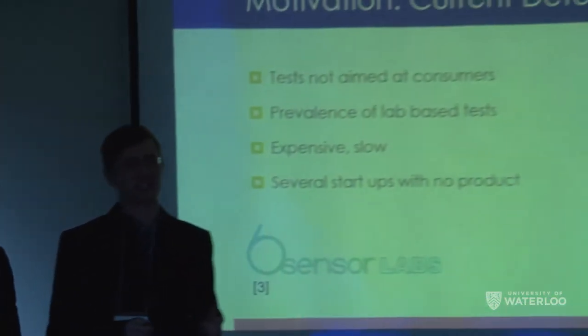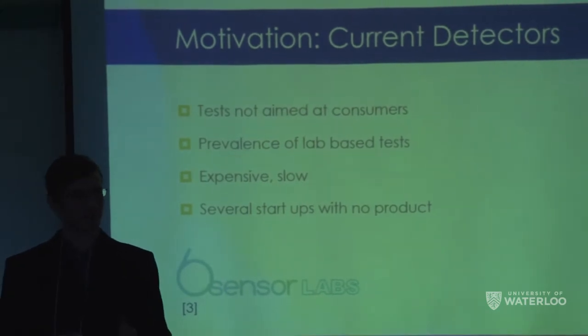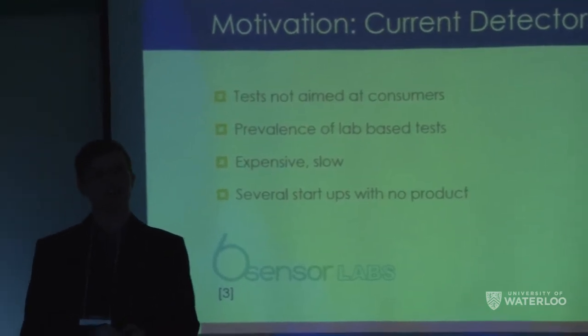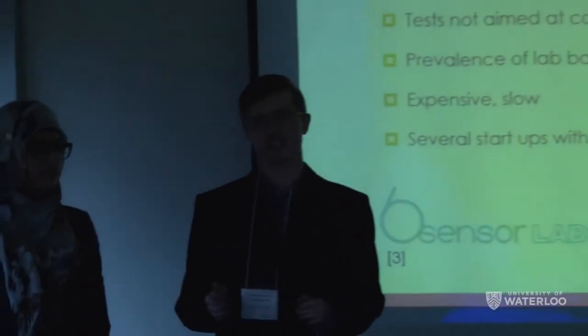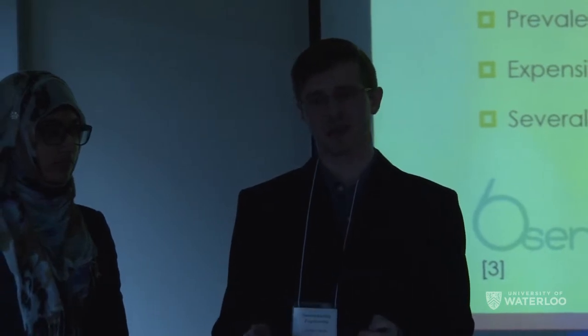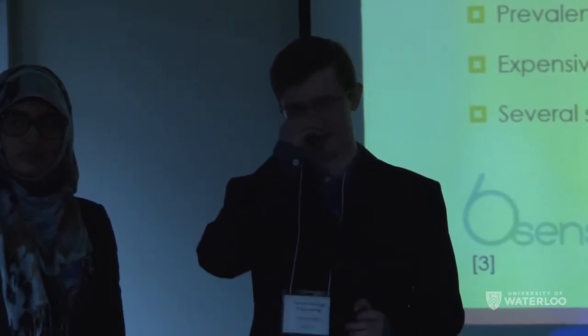And the final motivation was that the current detectors we've looked at aren't that good. They tend not to be aimed at consumers. They're aimed more at food processing plants or restaurants. This type of detector would require you to take a sample and then send it off for ELISA analysis at another lab. The tests that are aimed at consumers tend to have two big disadvantages.